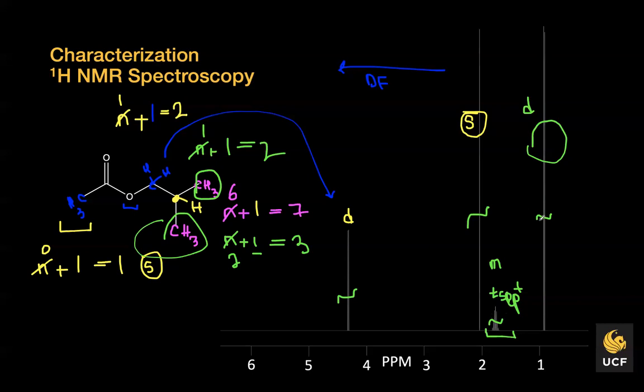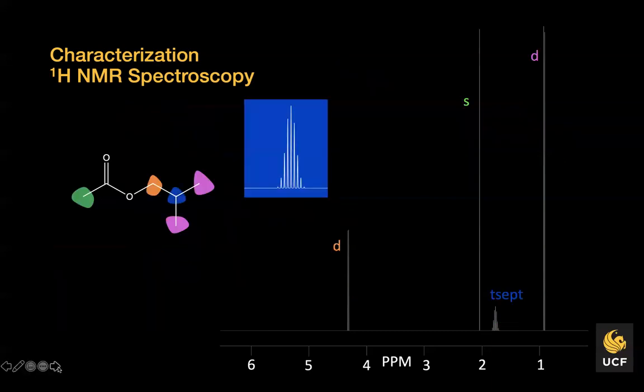But integrating it and then setting it up based on a reference, the area under that peak will tell us the number of protons that each peak corresponds to, right? It's not necessarily the height, it's the area under the peaks, and you consider all the peaks. Okay, so that's what we would end up getting.